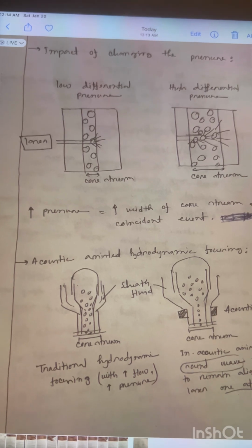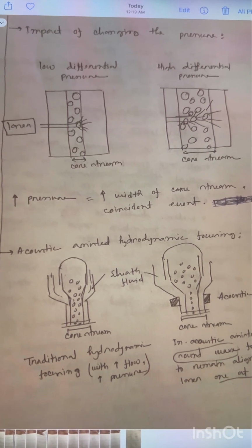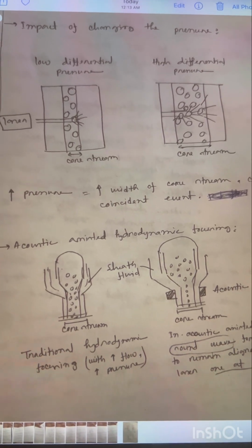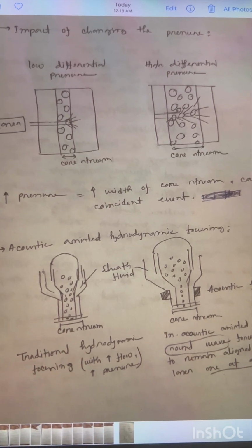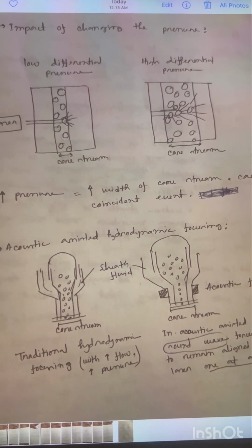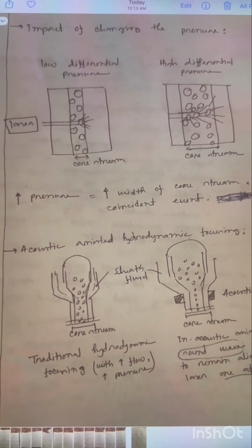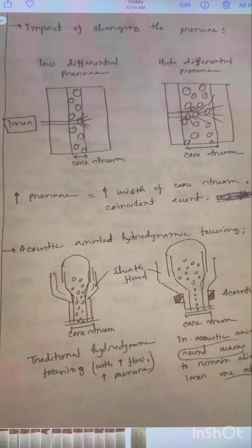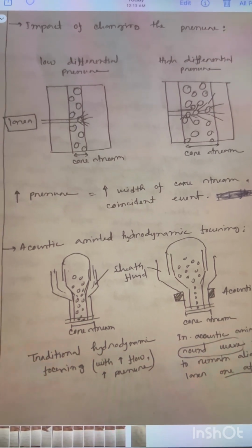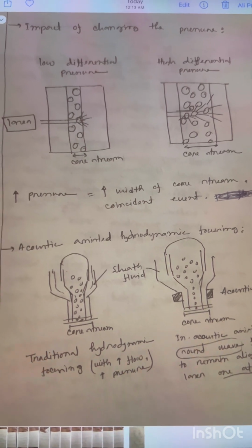The key information is that because of hydrodynamic focusing, cells stay in the middle position with a specific distance between them at a specific rate, so that at a time only one cell or particle passes the laser beam. It reduces the rate of coincidence so that we can get the data without any overlapping, and eventually it is good data.